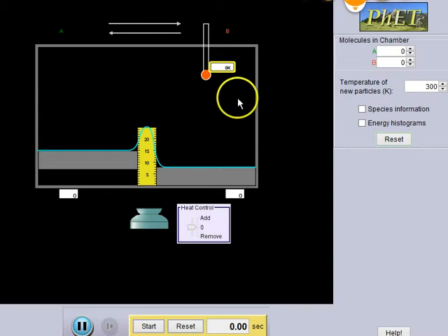Okay, so you guys, everybody sees this reversible reactions lab. Yeah. Okay. So as you can see, there are a couple of things. Let me just explain what's what. This tiny thing that says 0K, it's not OK. It's saying 0K. That's the thermometer, which measures the temperature.